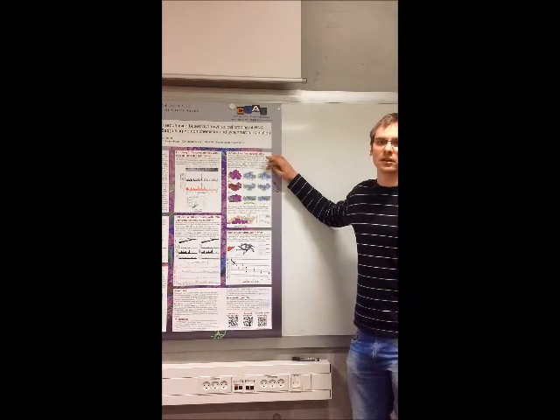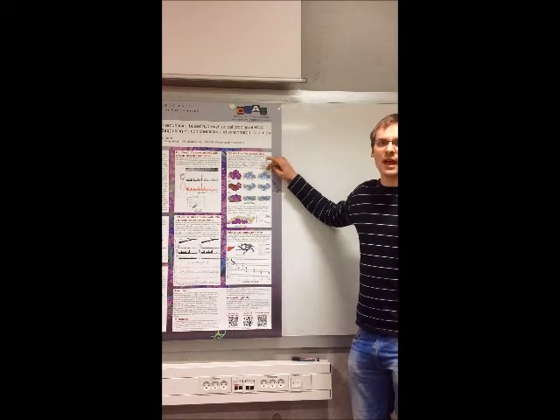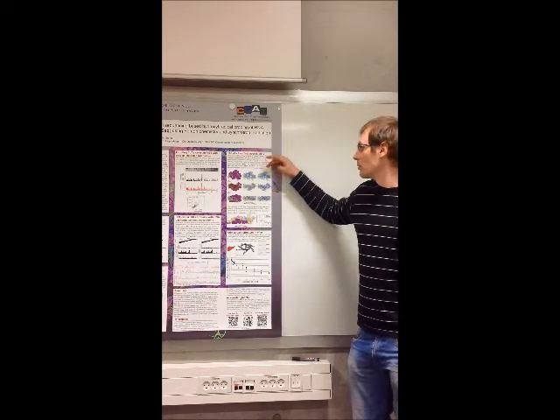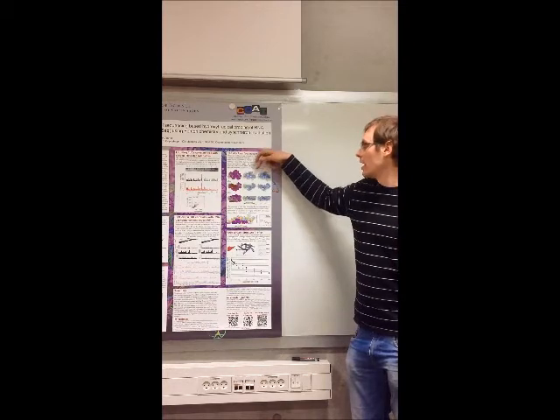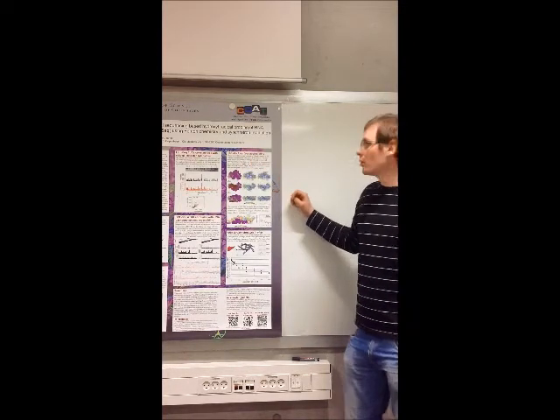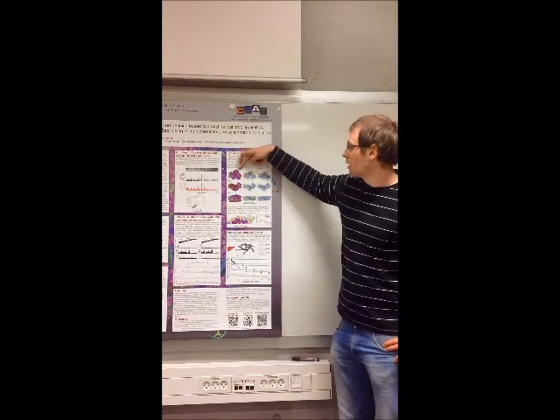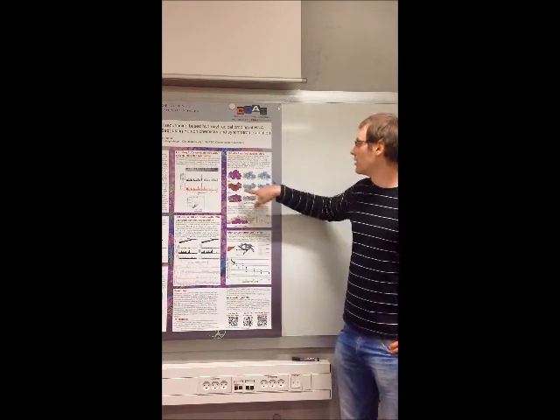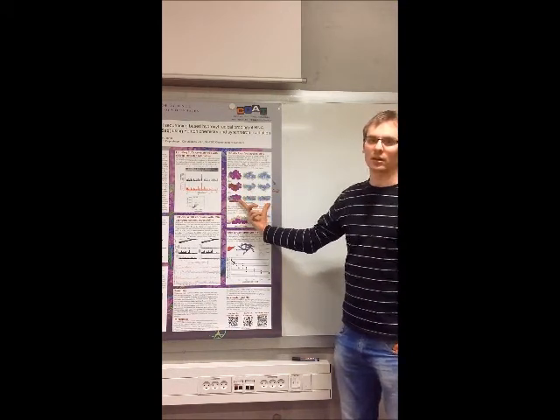Delta TCR signal displayed on the 16S rRNA structure underscores the high level of similarity between delta TCR and the known backbone accessibility. Moreover, the protein and large subunit footprints are clearly recapitulated.